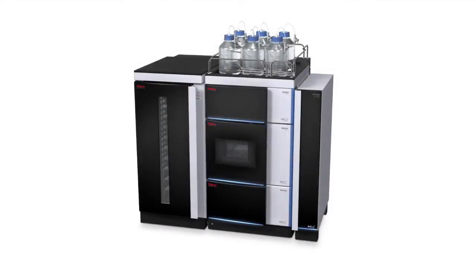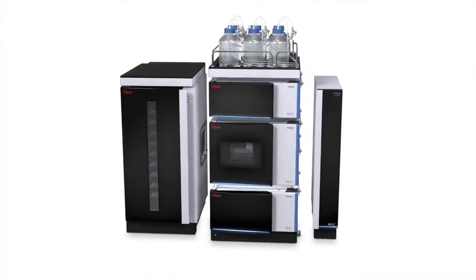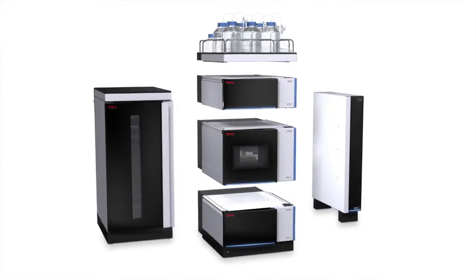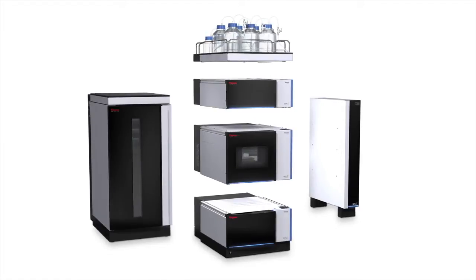The Thermo Scientific Vanquish UHPLC system was built around the column and the user to deliver better separations, more results, and easier interaction to meet the throughput demands in modern laboratories.